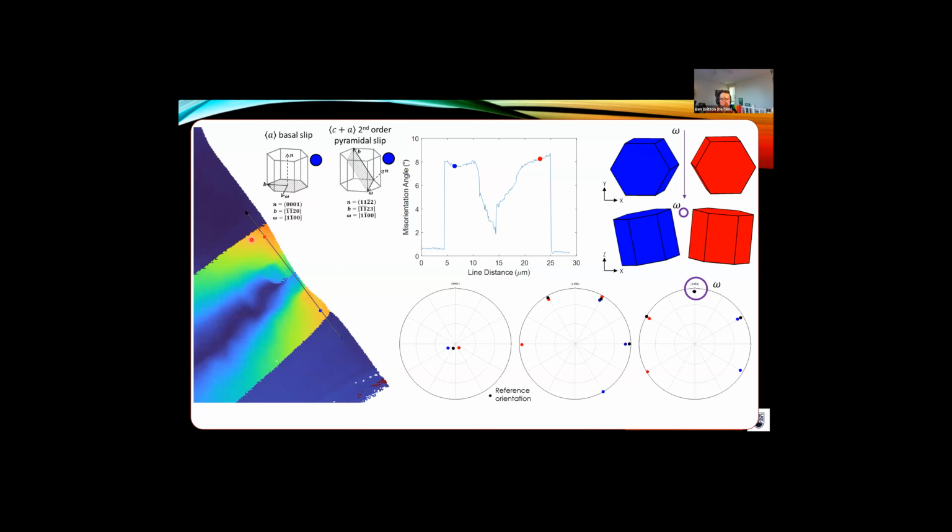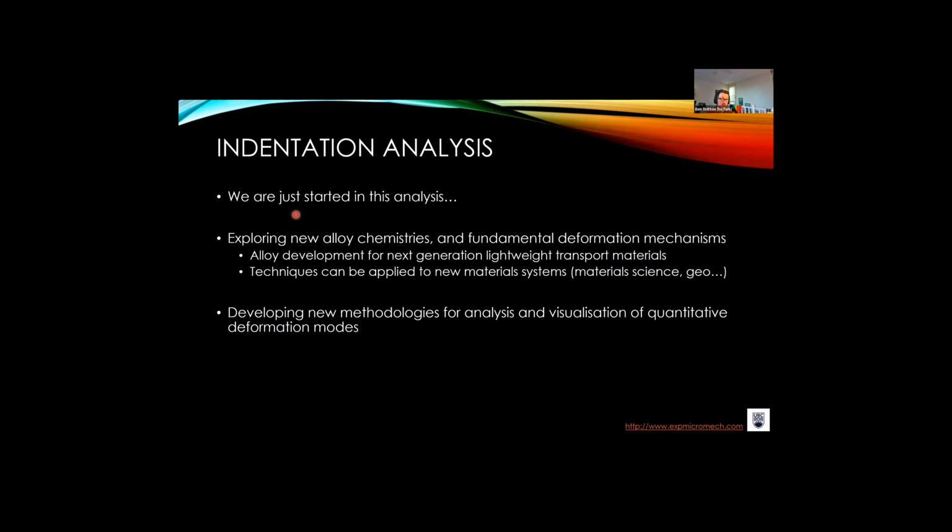But I stress we can only access this through this 3D serial sectioning to build up the full picture of this deformation under the indent. So it just highlights that indentation analysis, we've just sort of started in this piece with our 3D data sets, and we're starting to explore new alloy chemistries and fundamental deformation mechanisms.